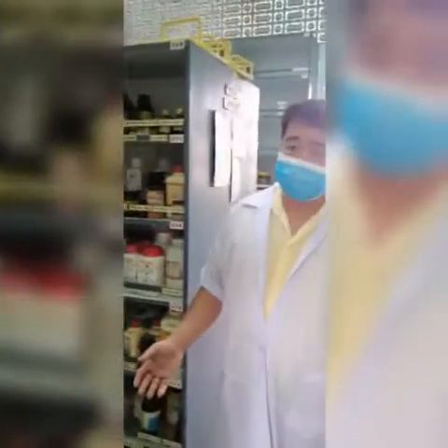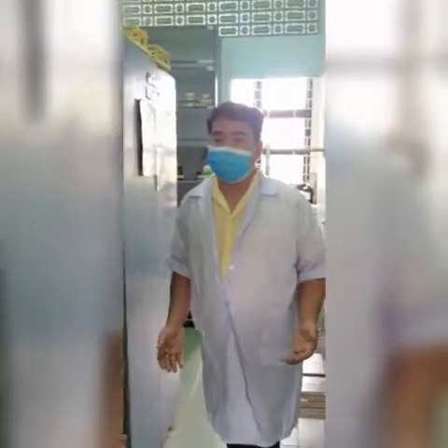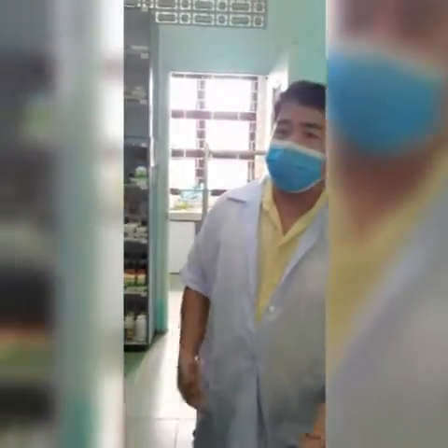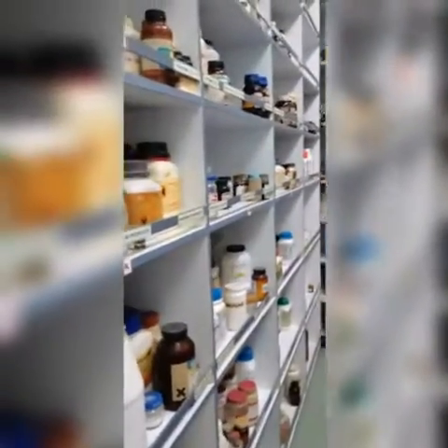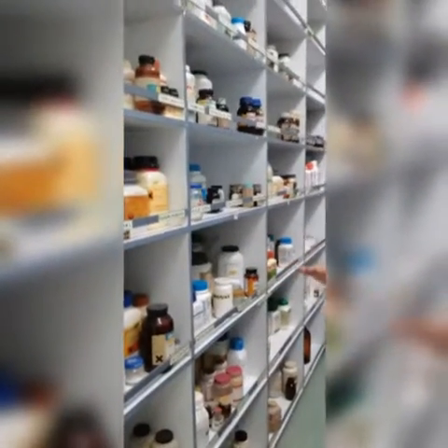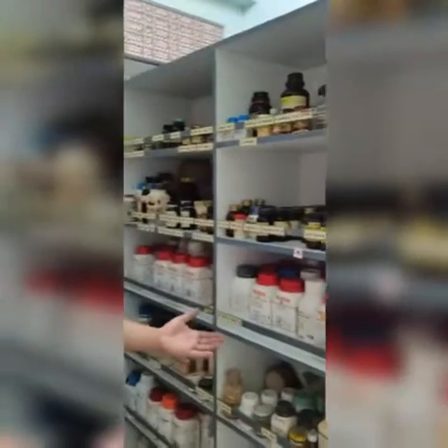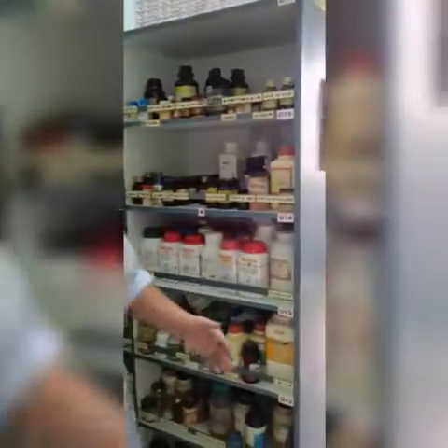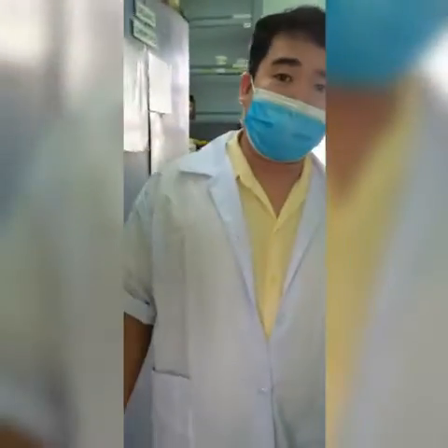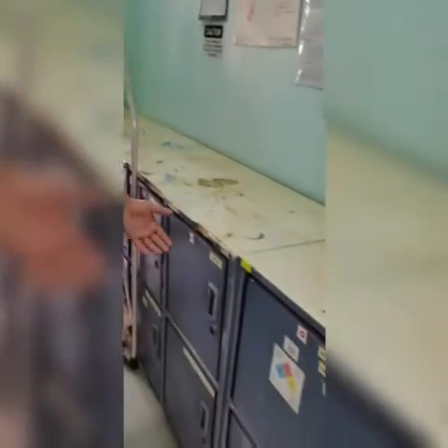The chemicals are arranged according to their types or category. We have the different island cabinets in order to keep the chemicals safe. At the sides, you will find the different inorganic chemicals arranged alphabetically, and at the middle, we have the organic chemicals, the liquid and solid organic chemicals. On the other side, you will find the organic solvents.